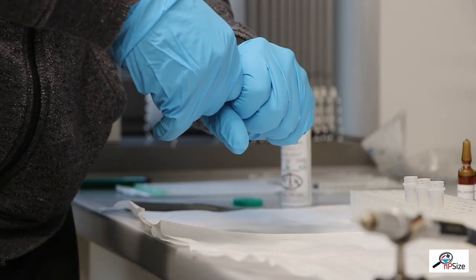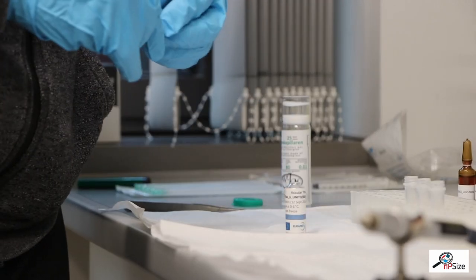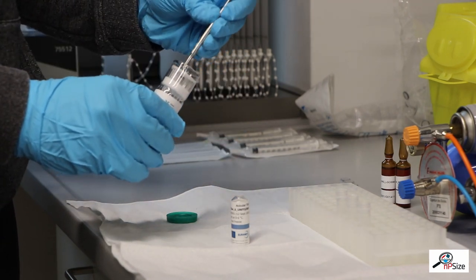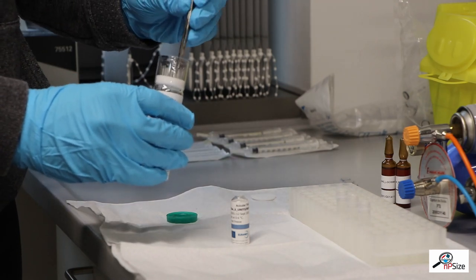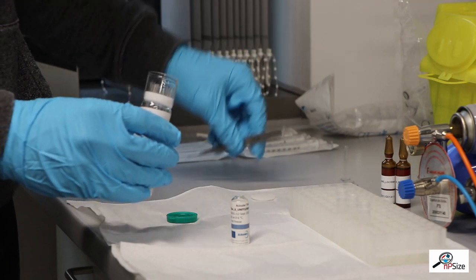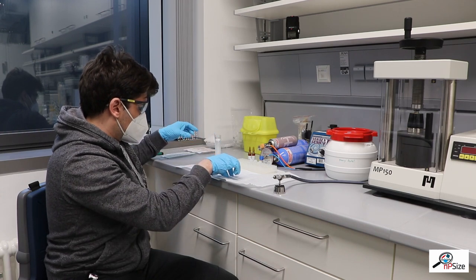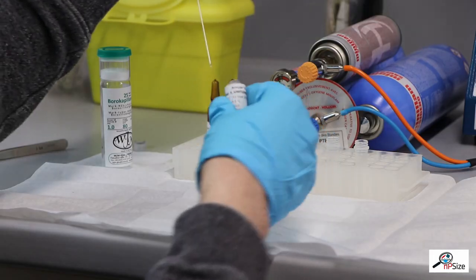First the ampoule is opened. Then he picks out a single capillary from the package. This must be done very carefully because the glass of the capillary is only 10 micrometers thick. Then a small volume of the sample is drawn out of the ampoule with a disposable syringe.